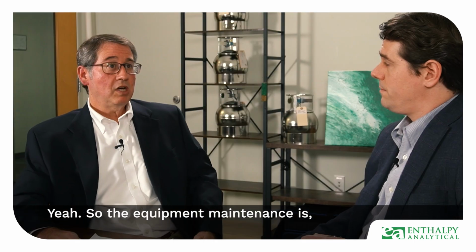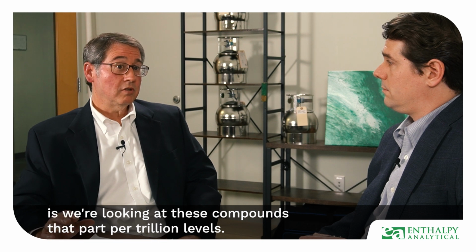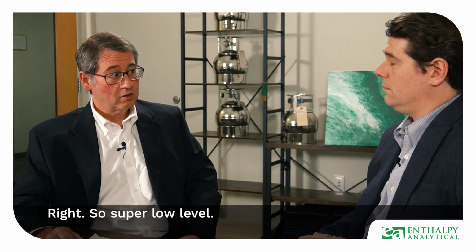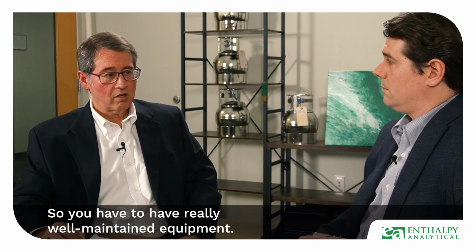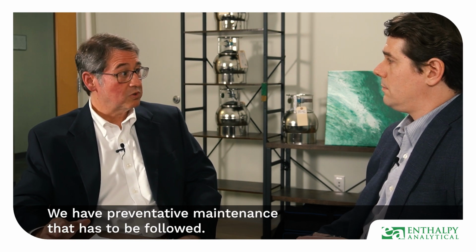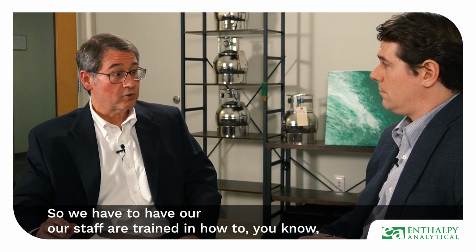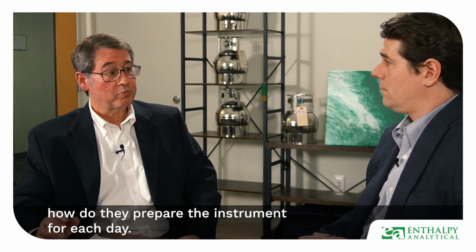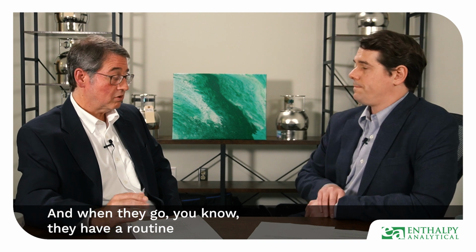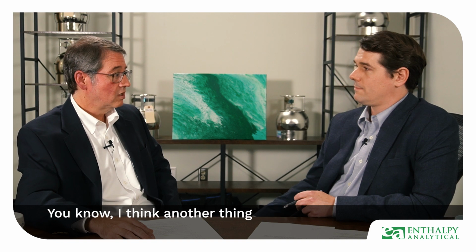Yeah, so with equipment maintenance, one of the things we have to be careful of is that we're looking at these compounds at part per trillion levels, right? So super low level. So you have to have really well-maintained equipment. We have preventative maintenance that has to be followed. We also have routine maintenance. So our staff are trained in how to prepare the instrument for each day. They have a routine they go through to make sure it's in tip-top shape for each day they run samples for PFAS.